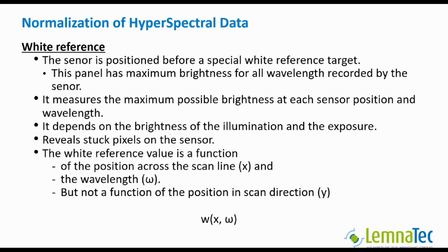A technical side note. In reality, we take for each of these reference data cubes a few images as if we would be moving, but without moving. Therefore, these data cubes look like if we had done a small scan. We do this to improve the signal quality of these cubes by averaging.